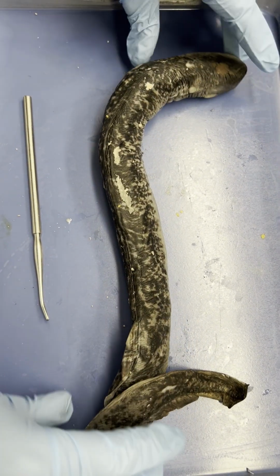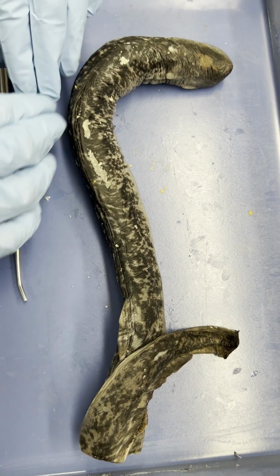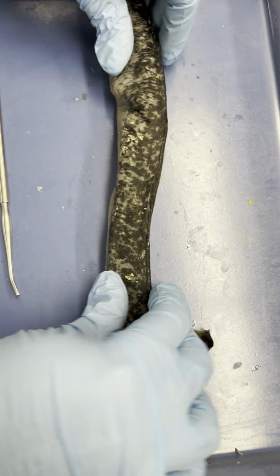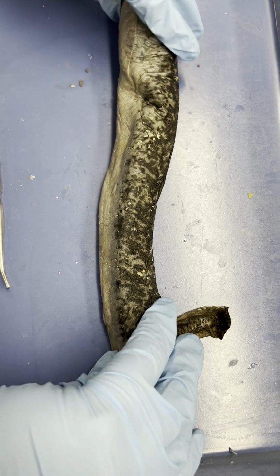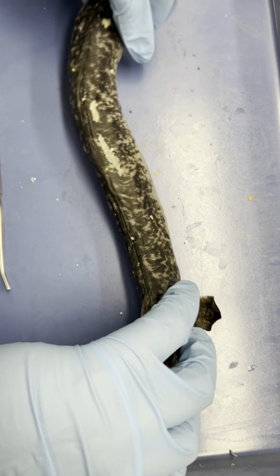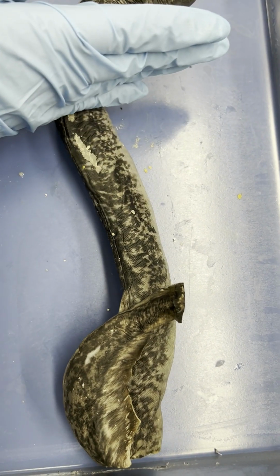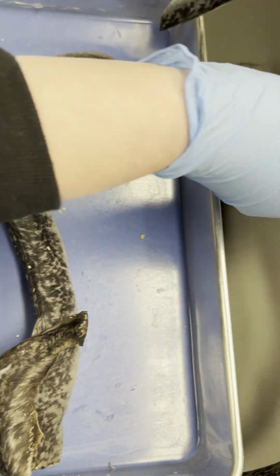It is a little difficult with how these guys kind of shape into curvature due to the preservative. So we want to straighten them out. And again, someone else in your lab group could be really beneficial to hold this specimen to keep it straight. But sometimes what I like to do to make sure that I'm not cutting too anterior or too posterior is to just compare it to my other one.